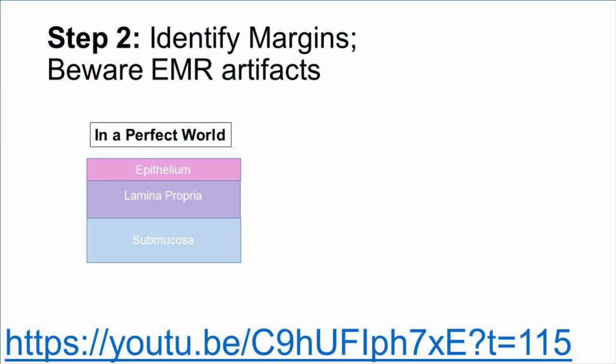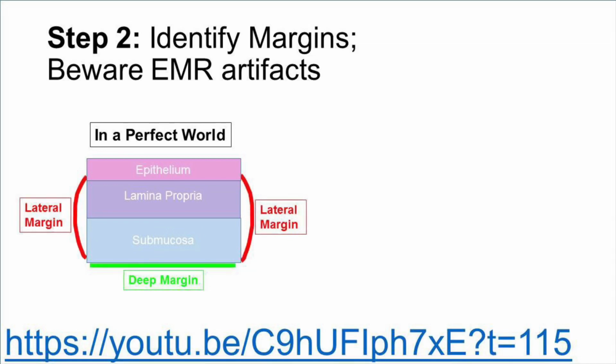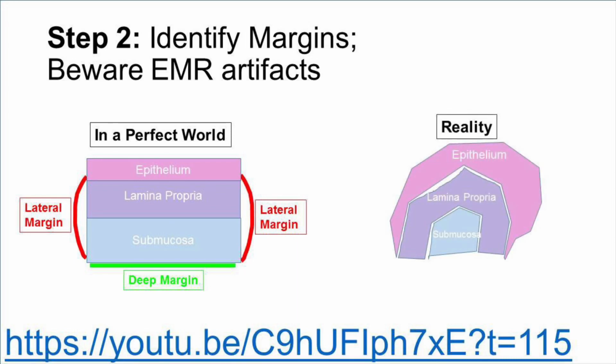Step 2, identify the margins. This YouTube link here is to show you how an EMR is actually performed. In a perfect world, your EMRs would be a perfect square, where the edges are your lateral margins and your deep margin is the deepest aspect of the specimen. But the world is not perfect, and in reality, the EMRs often come out like stepped on pieces of bubble gum and look something like this on the right.